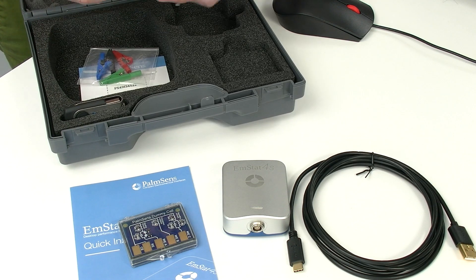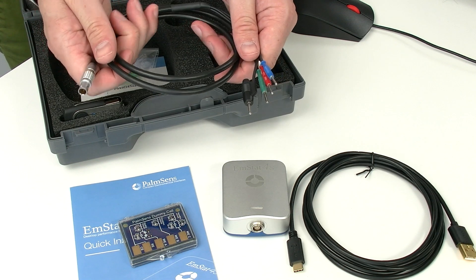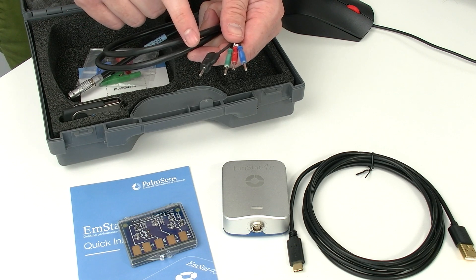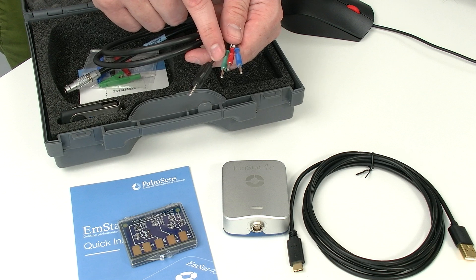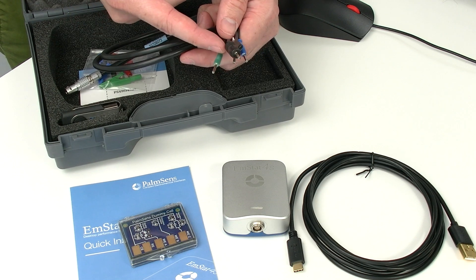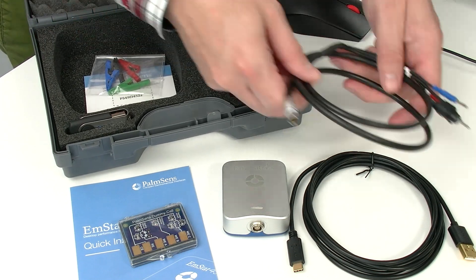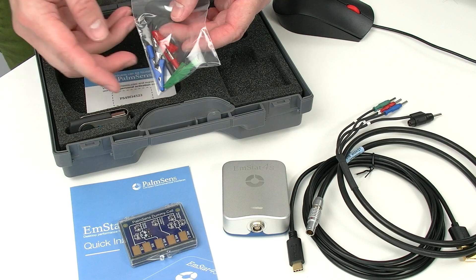Inside the box there's also our sensor cable to connect your potentiostat to your electrodes with four 2 mm banana plugs: blue for reference, red for working electrode, black and stackable for the counter electrode, and green for the ground. Together with this cable, you receive the matching crocodile clips.